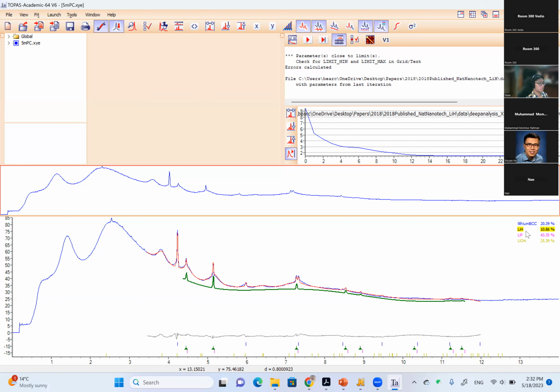We identified the presence of lithium hydride, and we analyzed the properties of lithium hydride, especially how it is in huge contrast to the lithium fluoride, which has very broad peaks. So these two components have very different properties in the interface. So in general, if a phase is more crystalline, it's best not to be messing around with the lattice parameter for that phase. Very good point.